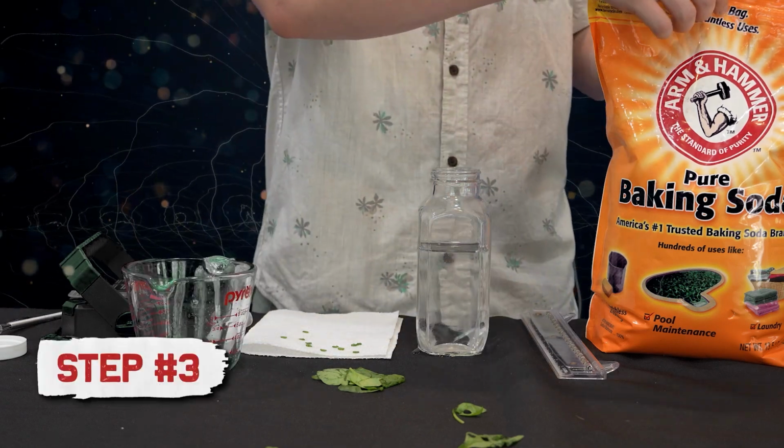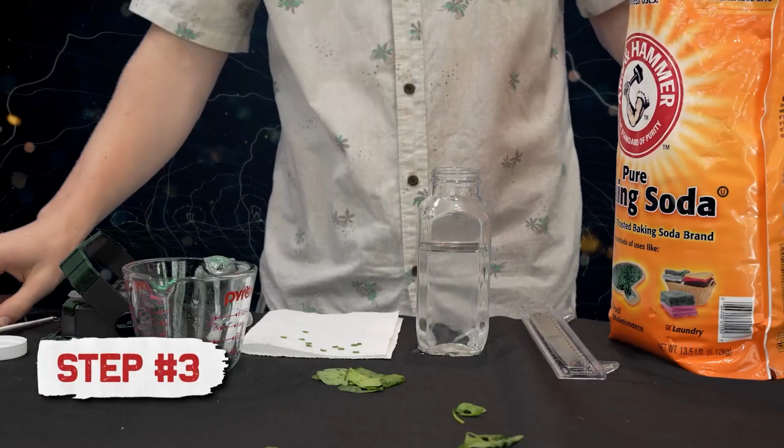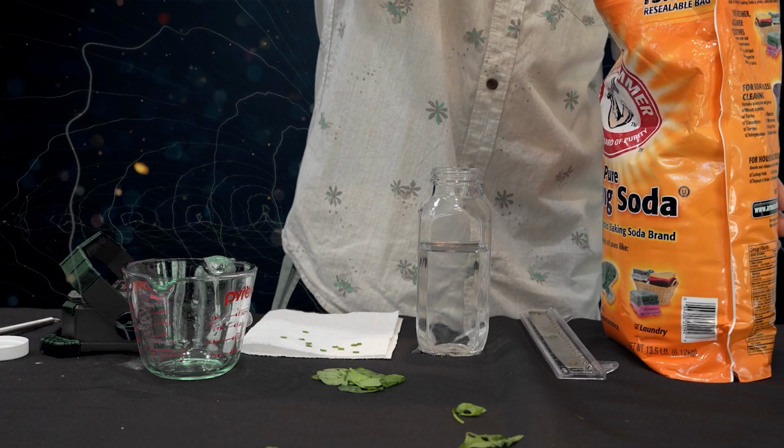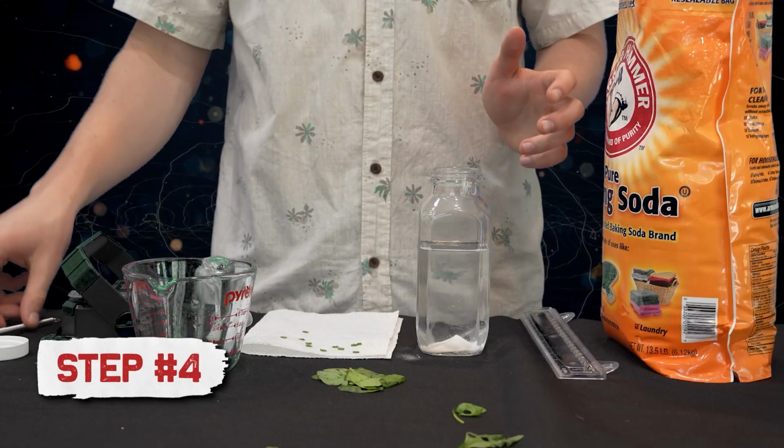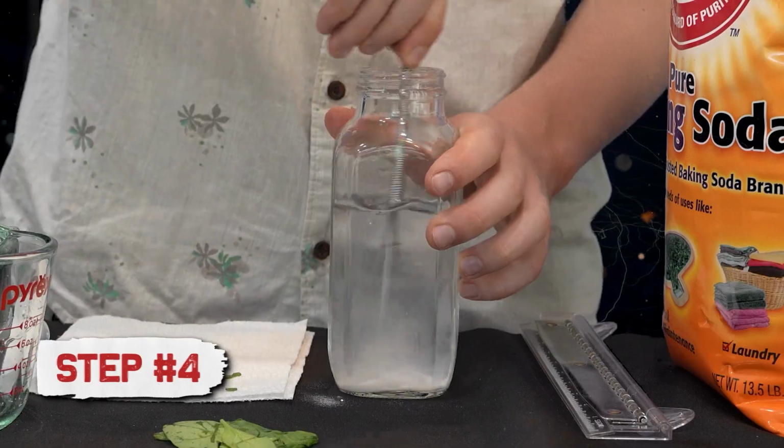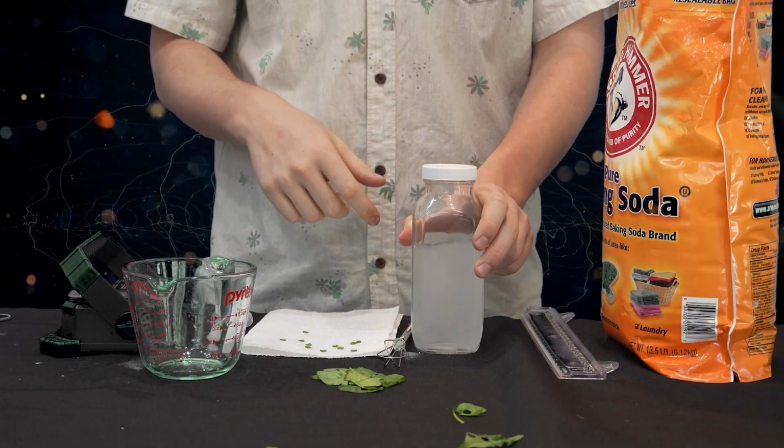And step 3 will be to get your baking soda. So we're just going to take a pretty big spoonful here, so it doesn't spill all over the place. And step 4 is going to be to mix it up. Just like that, we got some pretty cloudy water.